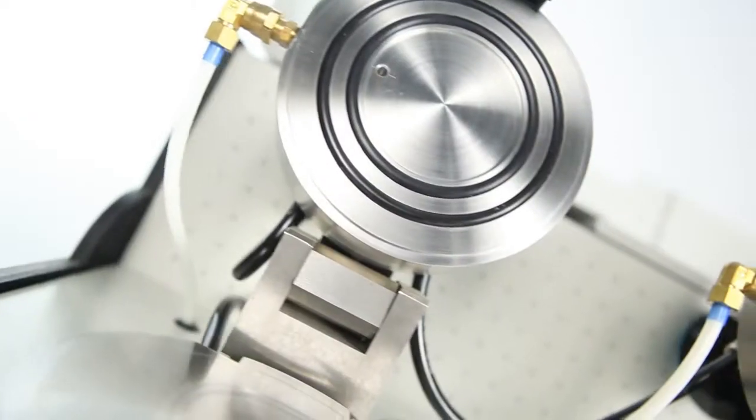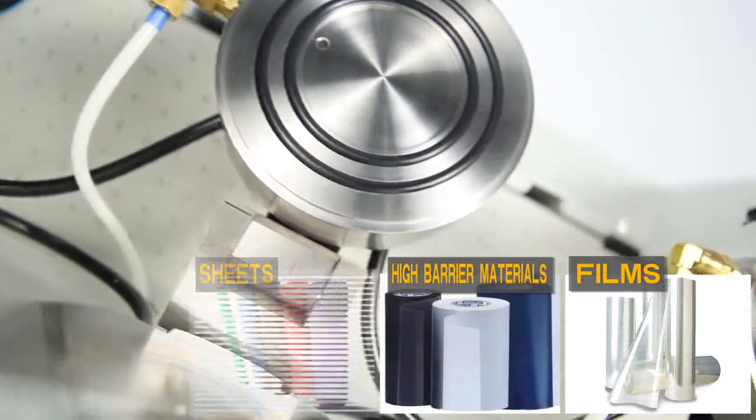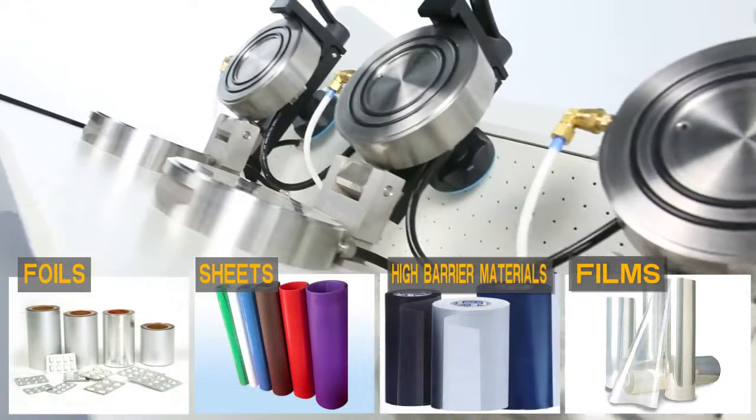It is designed for the barrier properties tests of films, high barrier materials, sheets, foils and other uses.